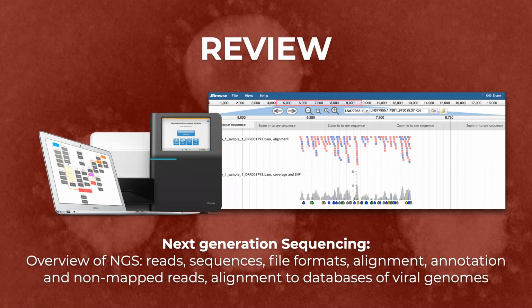And so last time we talked about how we can take sequence read archives that collect an archive of short reads, and map them onto a database of different available genomic sequences from viruses, bacteria, and other organisms, and then also map the reads that we identify belonging to a specific organism on the reference genome of that organism. So what you see here are some of those reads aligned to the reference genome of Ebola virus.